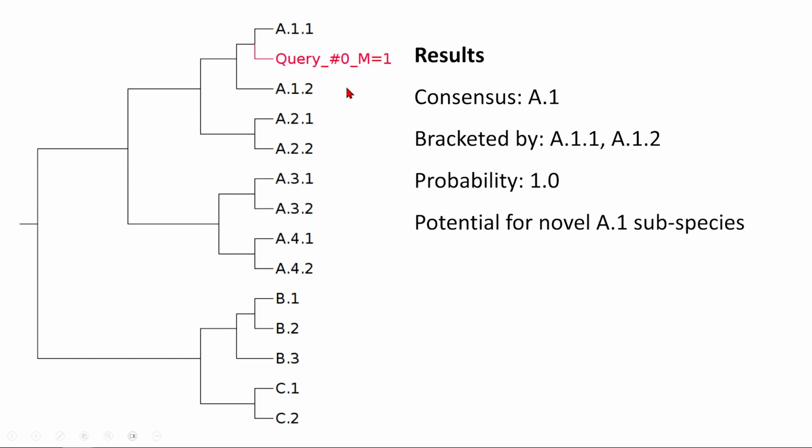Another good thing about the pplacer program is that it's likelihood based. So it can give you multiple placements if there's uncertainty about the placement, which in this case is not here. We just have one placement. And so here's the proposed result.